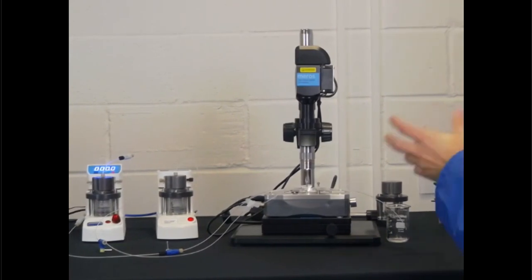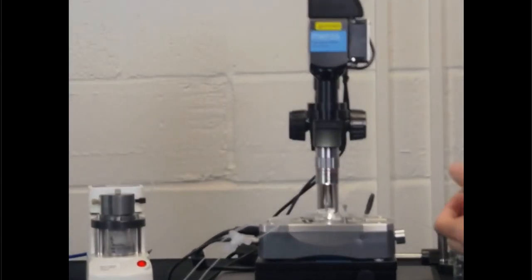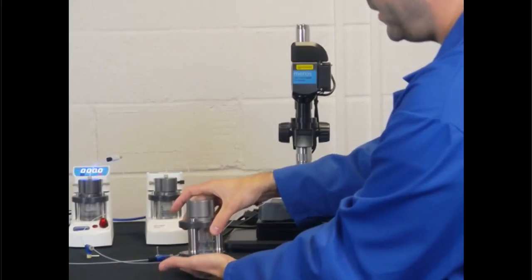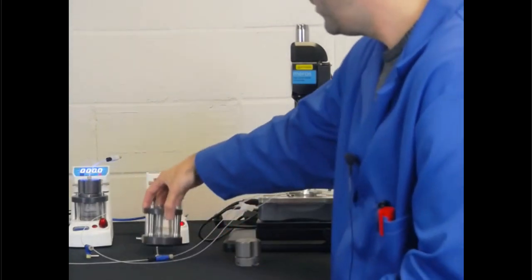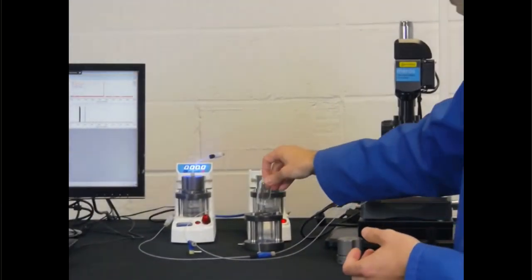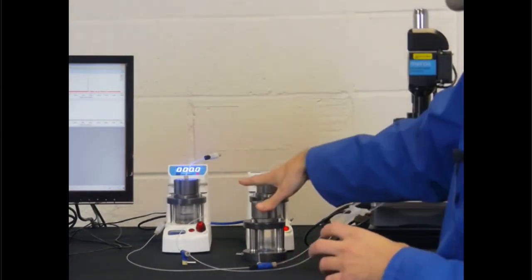So is it possible, in case we want to warm up the lipids because they are not very soluble and you need to increase the temperature, to plug those pumps to a remote reservoir like this, which can be placed on top of a hot plate having a stirrer inside, and we can simply plug this reservoir to the pump using some extra tubing. The solutions are normally contained in a small vial like this, which goes inside the reservoir. This can be sealed like that and then connected to the pump and pressurized.